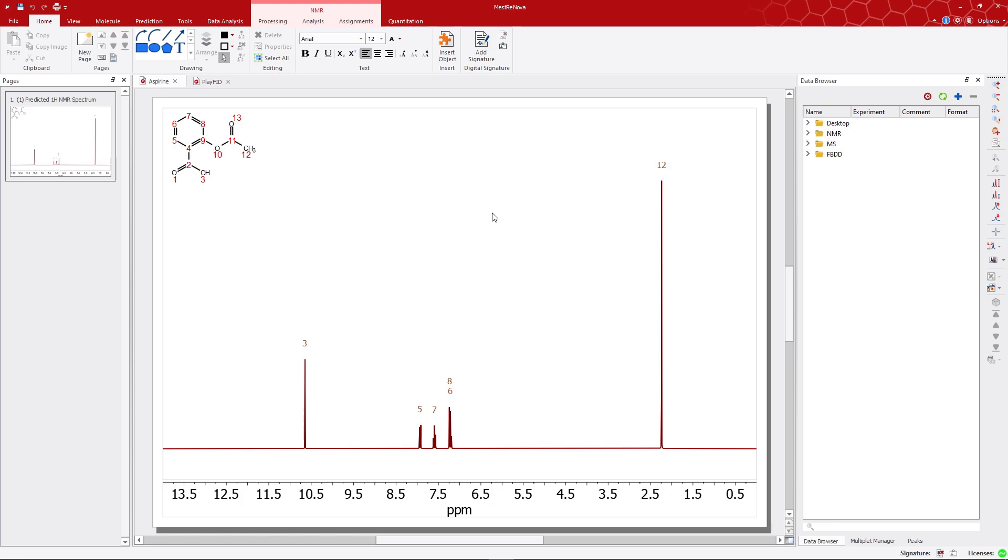Welcome! In this MNOVA tip, we'll introduce you to Play FID, a new tool implemented in MNOVA for the acoustic reproduction of NMR FID and multiplets.